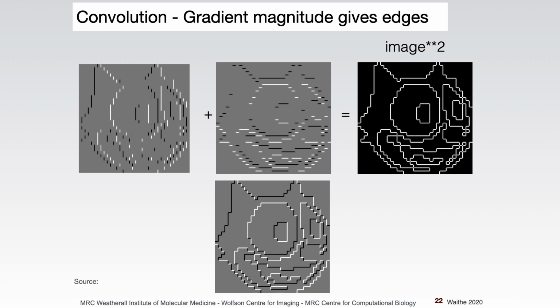The reason I've done this to Felix is because without any smoothing, this doesn't work very well. And because Felix is just very dramatic edges, it works well on that image. But you would find using filters just like this with no smoothing wouldn't work very well on a normal image. So just bear that in mind.